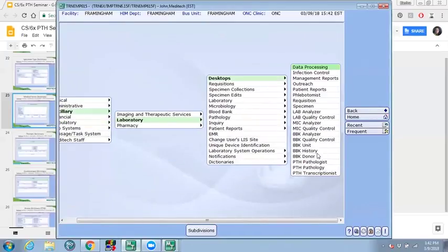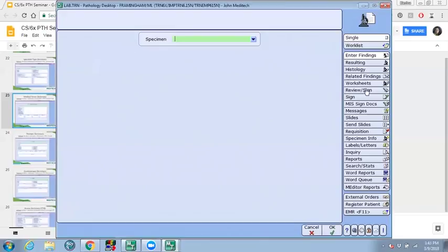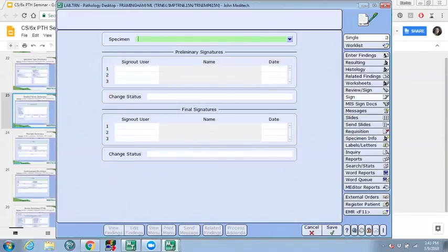How you could do it, so if you go, oops, nope, that is not the right one. Let's just go back into our pathology case. And I will really quickly just sign out the case for you guys. I did not sign out my case, but I will do it. Basically the same sign and unsign will be within the same routine. So either to sign it or to unassign a case, you still have to be within the sign routines. And I had my case 52.